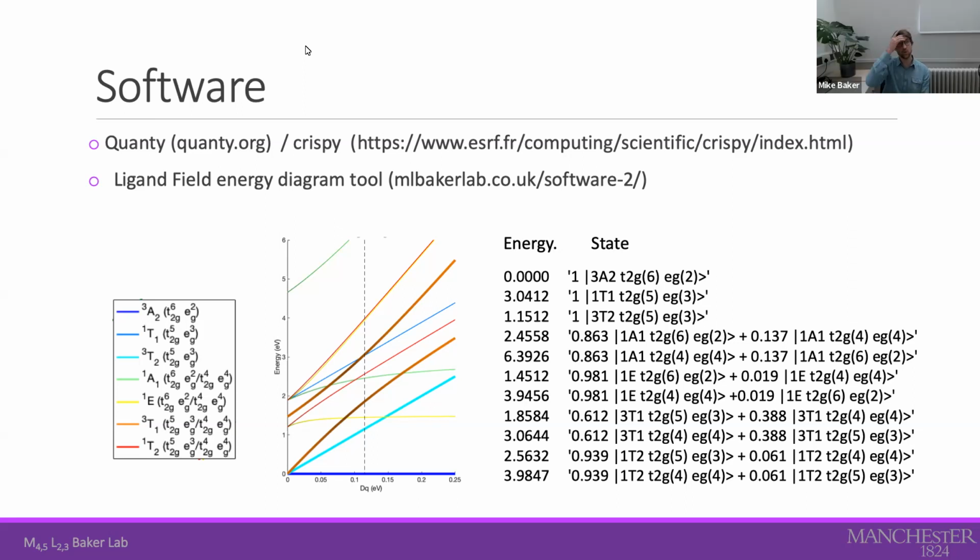Well, yeah, of course you always need to keep in mind, depending on the valence, what the electron occupation is. If you have, for instance, an unoccupied 4d shell, and you're wanting to access the L edge, then things can be a little bit more complicated, since there you don't have such a sharp exciton.